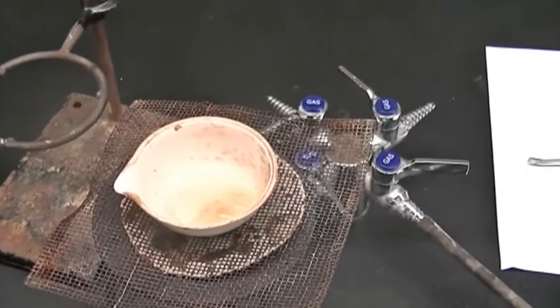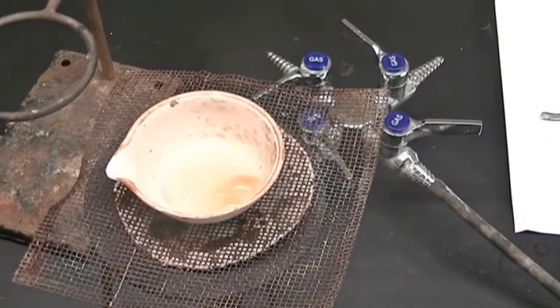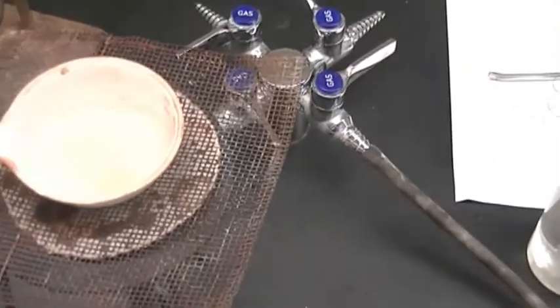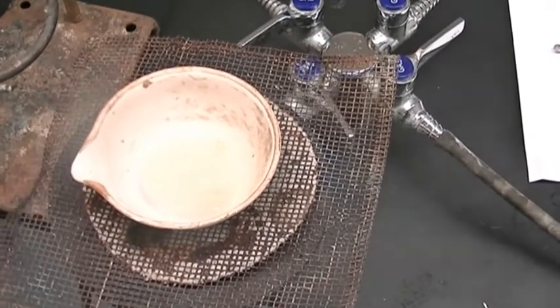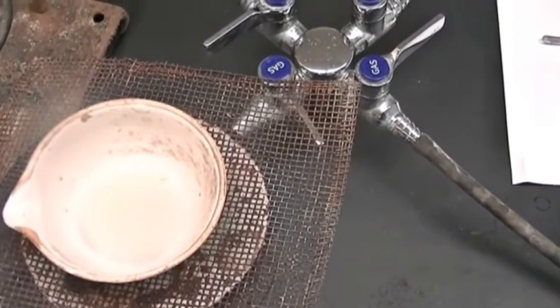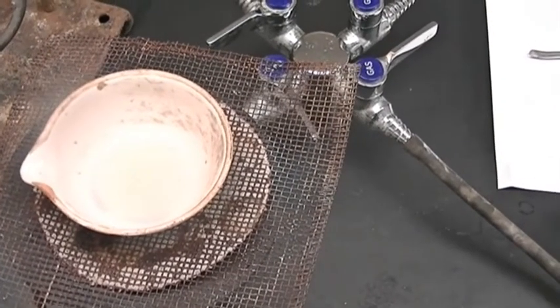All right, so that is dissolving the silver. So I can turn the heat off. All right, and so now we have a solution. All of the silver has dissolved. All right, so we will let that cool a little bit.